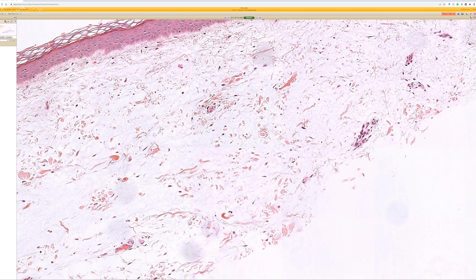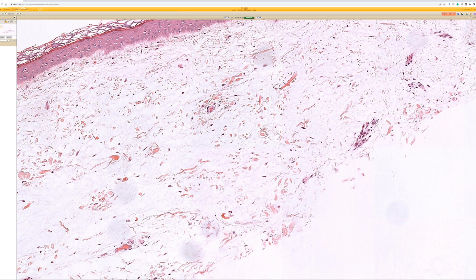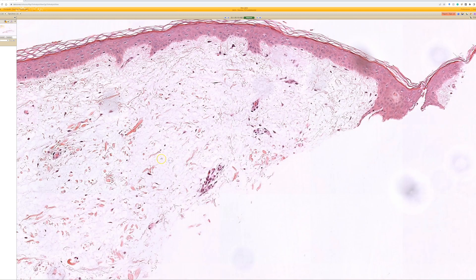Sometimes, if it's an older slide or a pale slide, you could also wonder if it's edema. Actually, edema and mucin can look pretty similar microscopically.